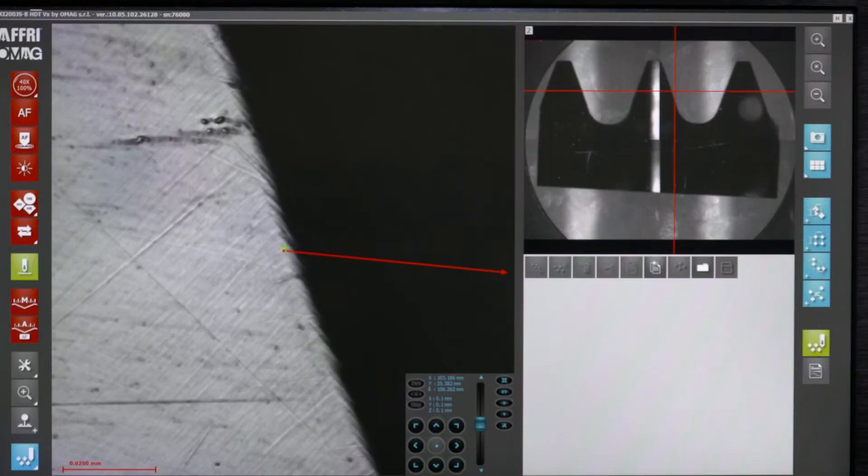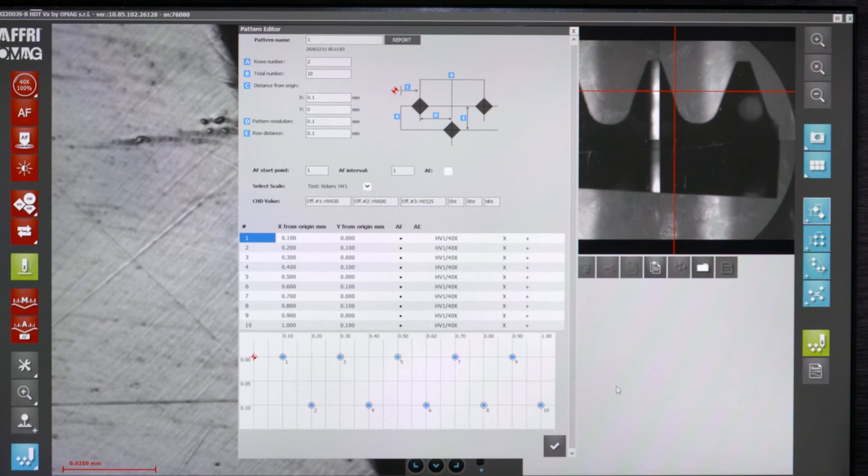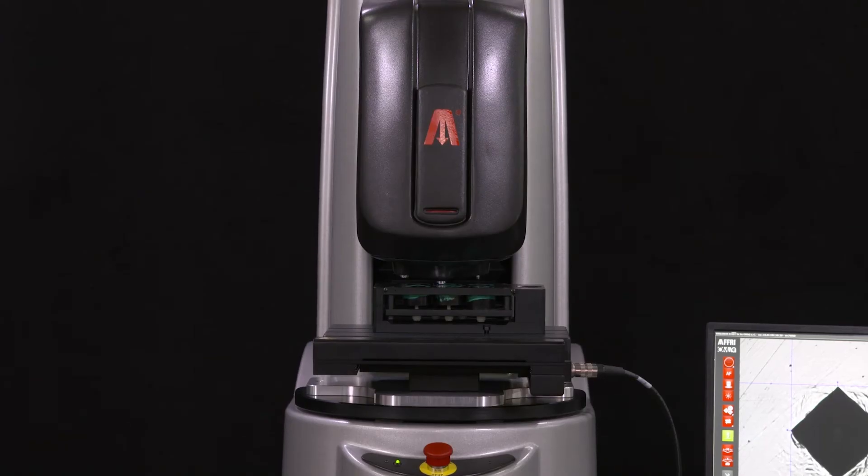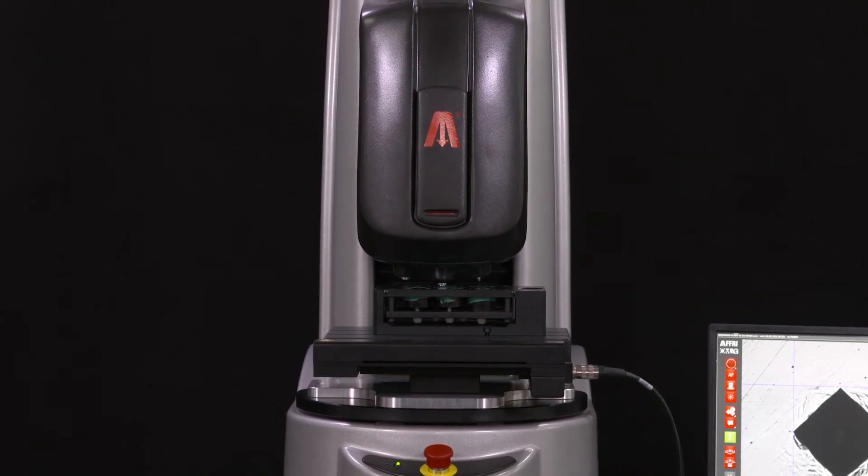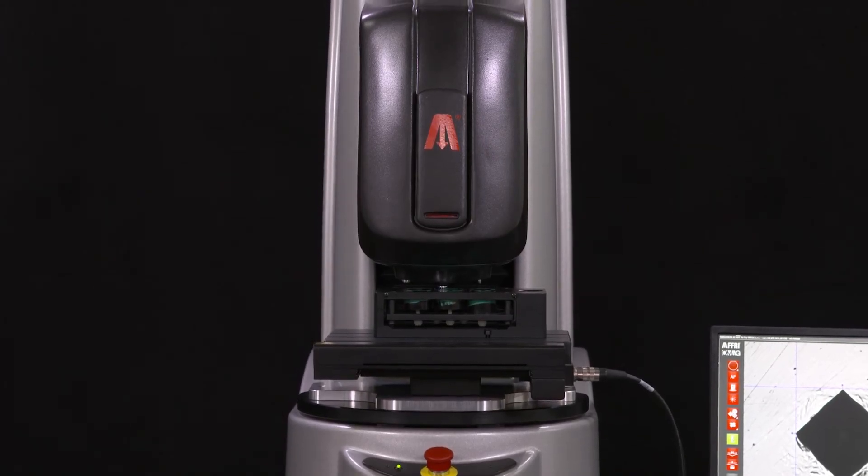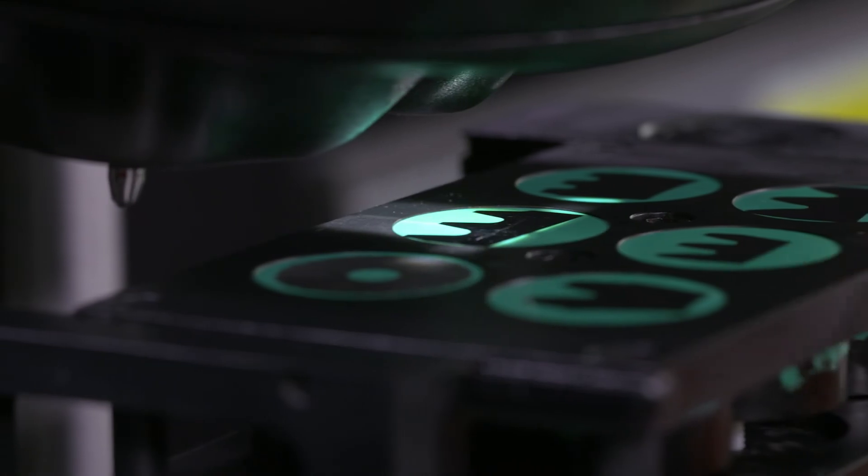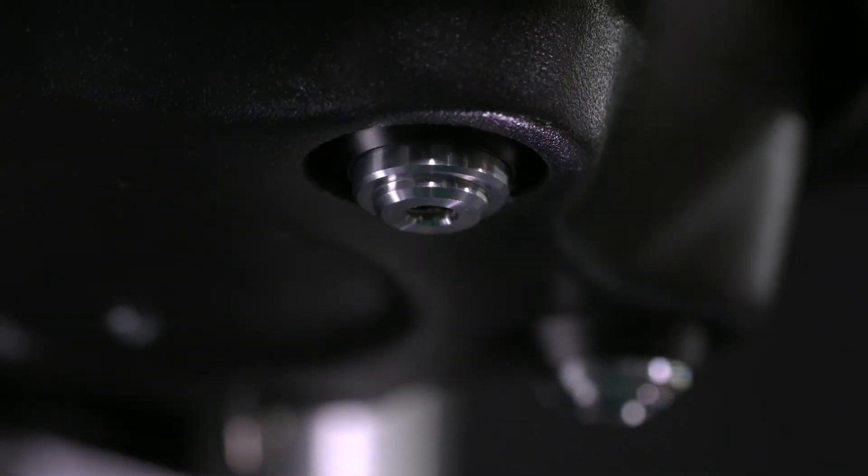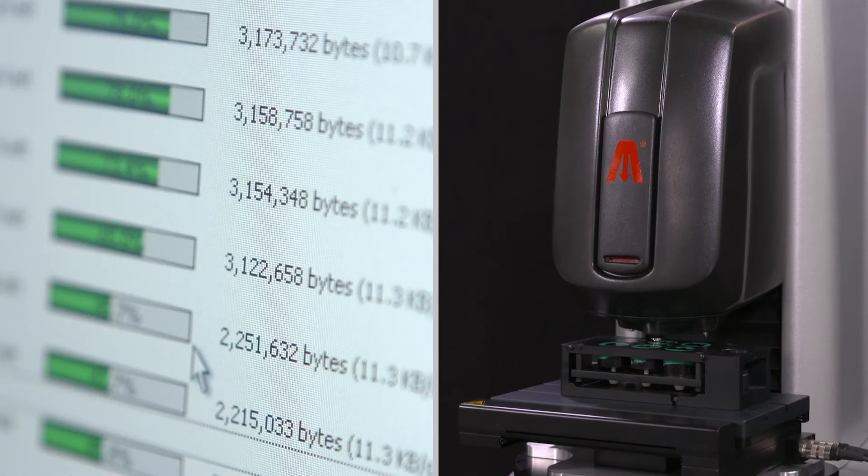The test report can be customized by the operator with the company or customer logo. It contains a range of graphs and images of all the indents.